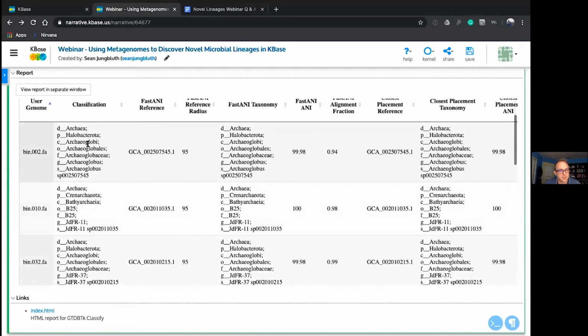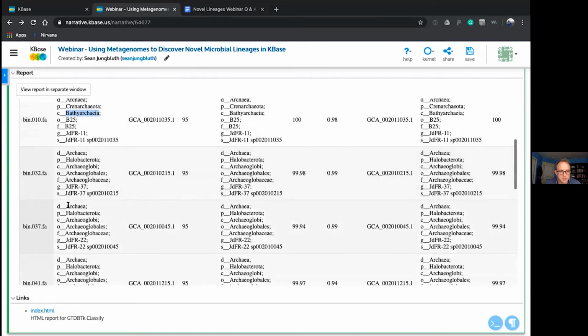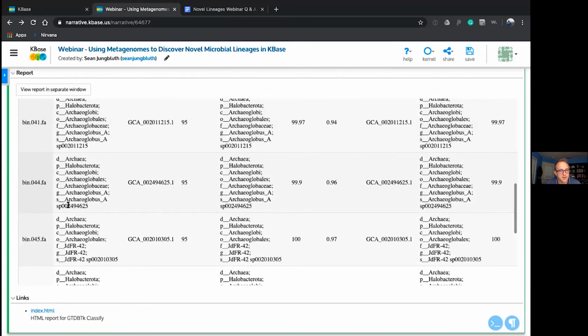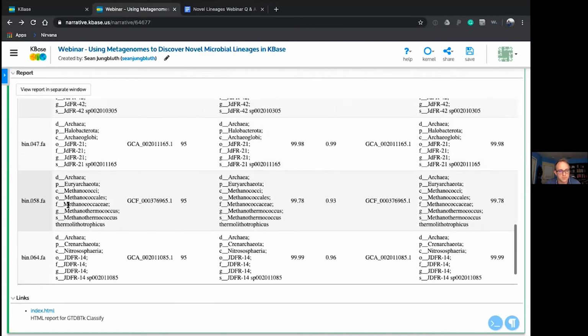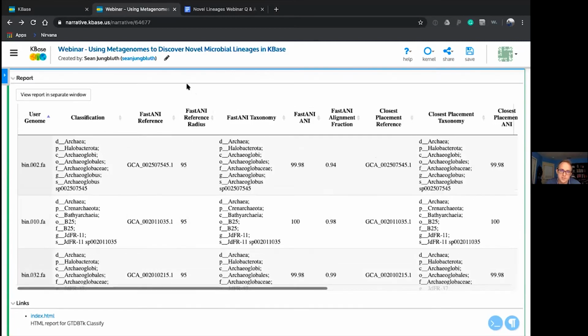It looks like we're getting unique archaea within the Archaeoglobi lineage. We have these Candidatus Bathyarchaeota lineages, which, if you remember Kaiju with the RefSeq database, it wasn't able to identify correctly, but with the NR database we got a bit higher resolution. So it's nice to see those confirmed with GTDB. There are also other archaea that have popped up and that we've published on before. So lots of novel lineages.